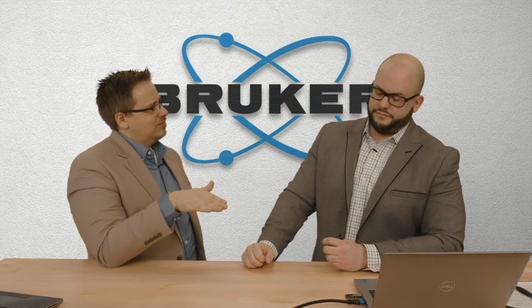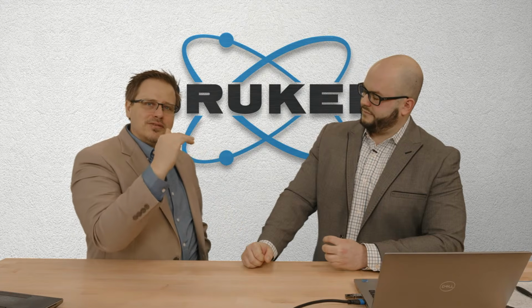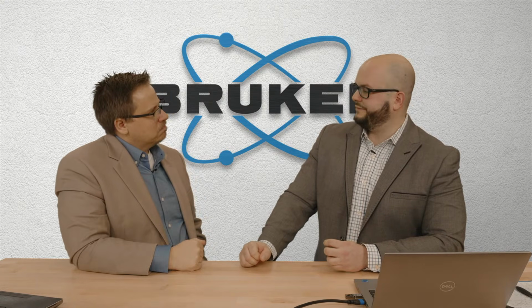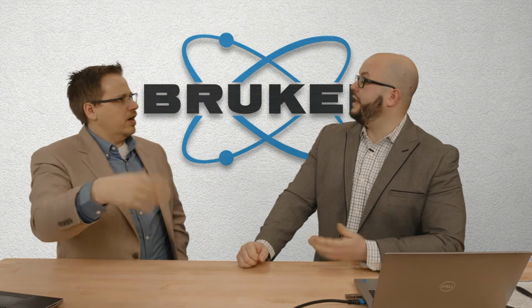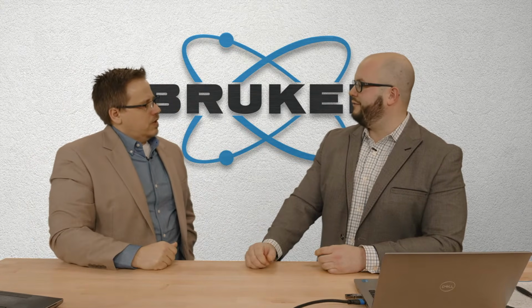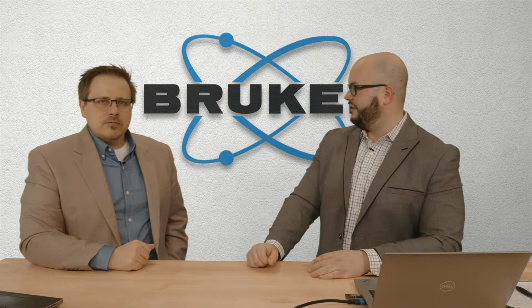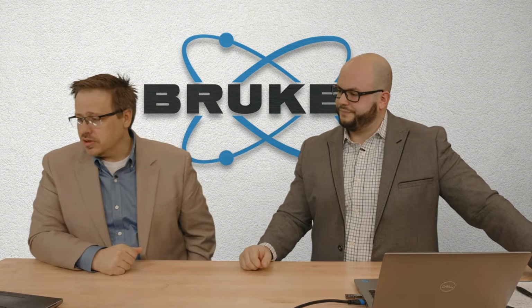Now, actually, now that I'm thinking about it, what you could do is go into the database and put a different entry in for each of the temperatures, with the different 2 theta, because that 2 theta is the assumed D spacing. So you could put in iron 211 at room temp, iron 211 at 100. Yeah, that's a great point. So you could just go into the software and change the actual angle, the relative angle, and then, whatever that temperature would be, measure the D-spacing of the stress-free sample. That'll allow you to use the software to actually calculate the stress at each temperature. Yeah, it's a good question.